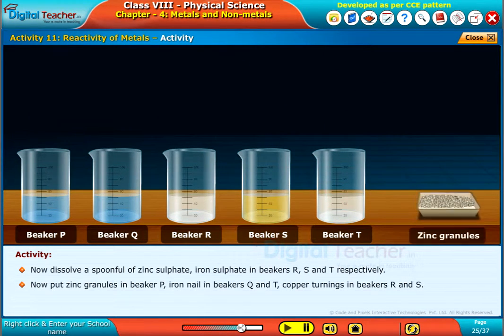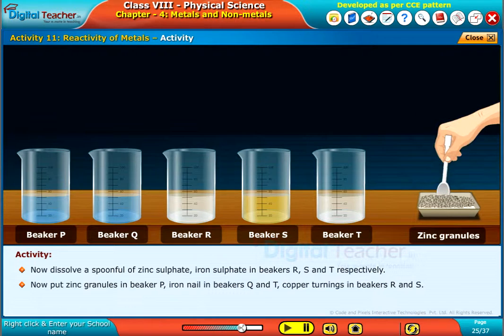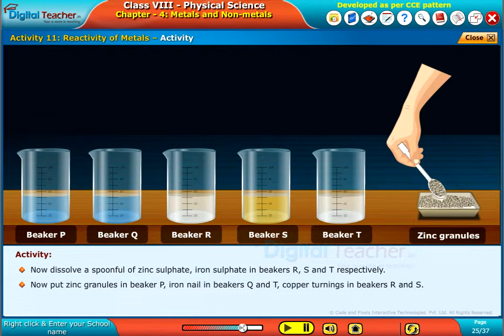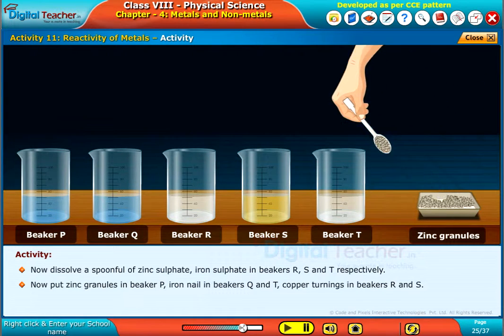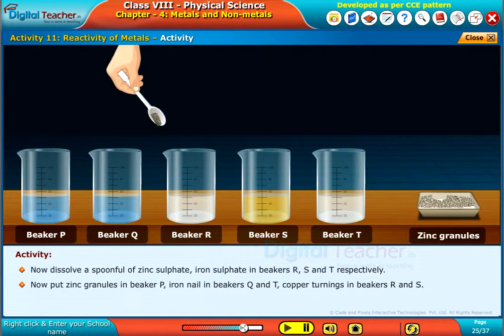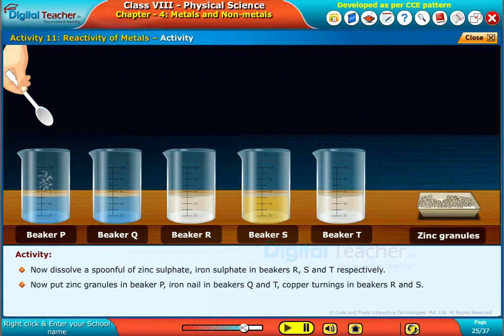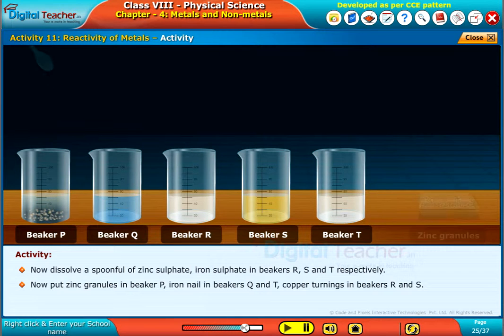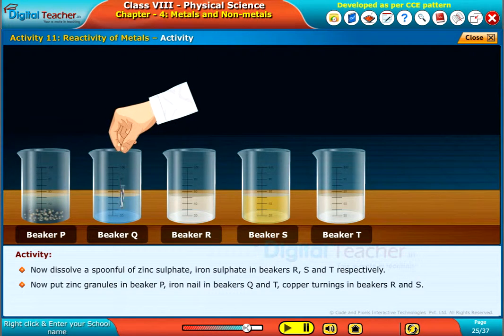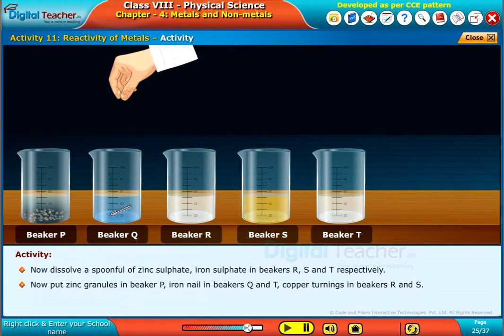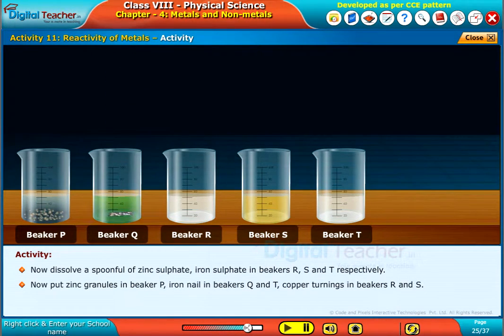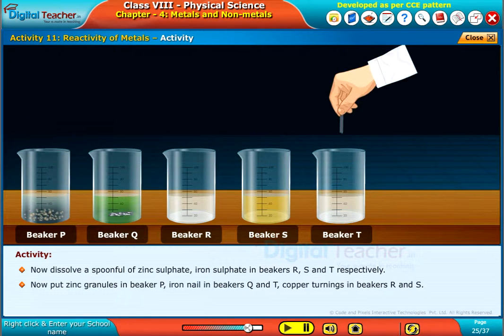Now put zinc granules in beaker P, an iron nail in beakers Q and T, and copper turnings in beakers R and S.